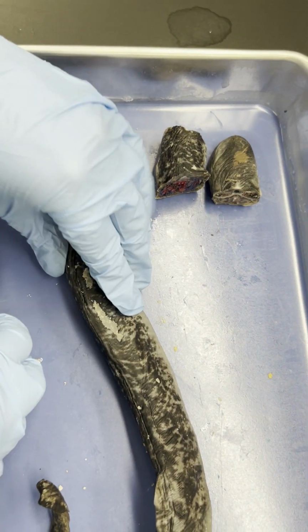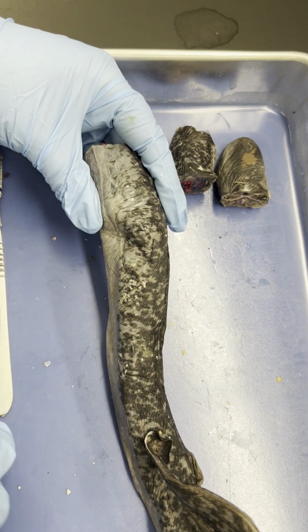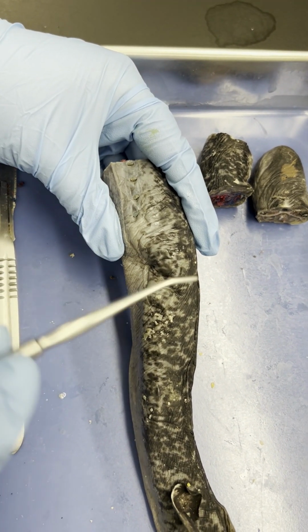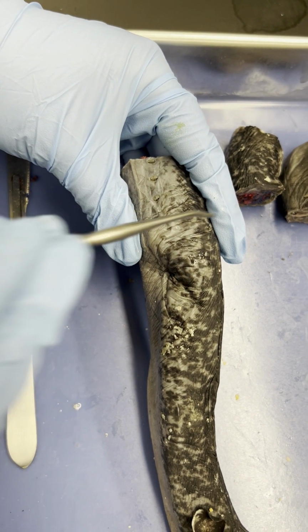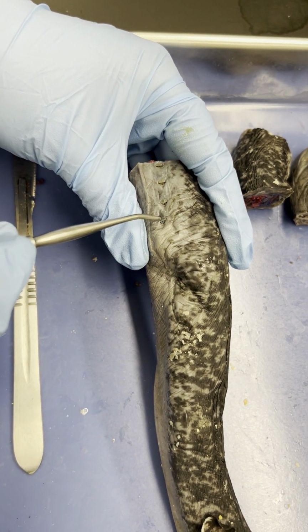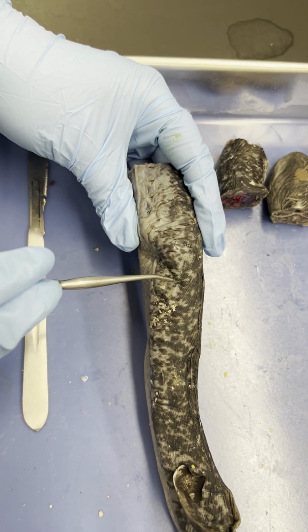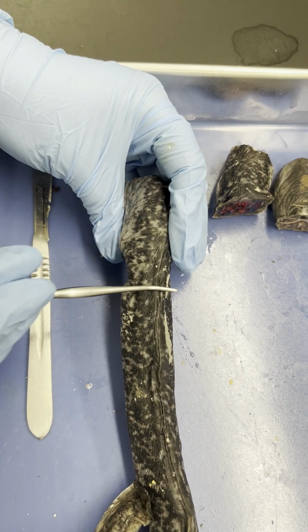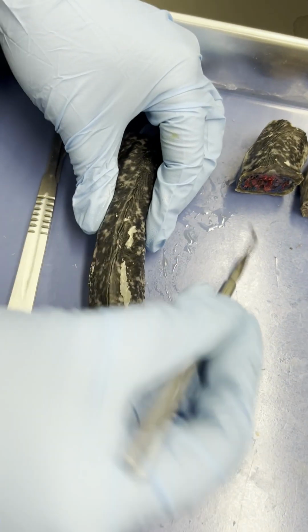So next we have the part of the trunk with the liver and the intestines. So if you can remember from what we just talked about, if I were to cut right by the 7th gill slit, that puts us right in touch with the pericardial cavity. So I'm just going to go a little bit further down. We don't want to go too far down or we'll miss most of the liver, but I'm going to cut about here and we'll see what it looks like. If we don't like it, then we'll just make another one.